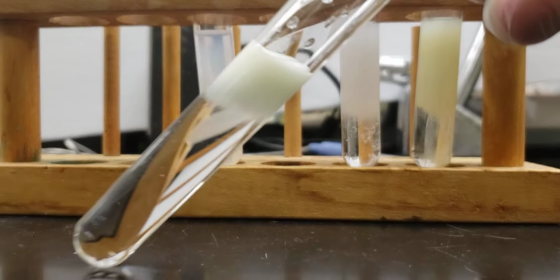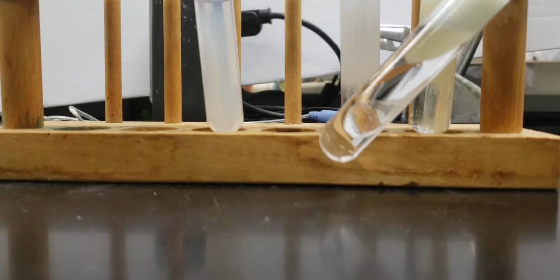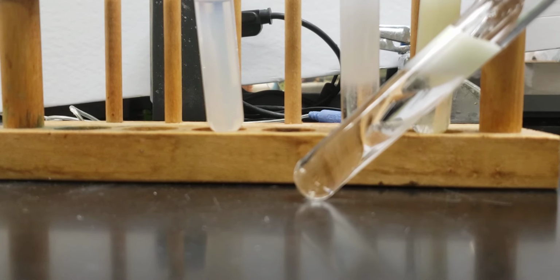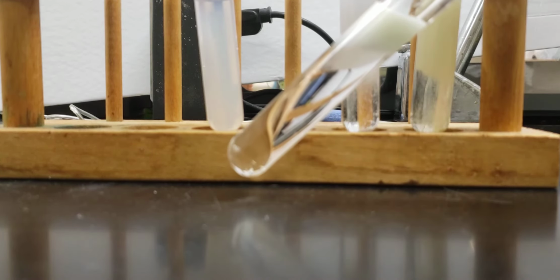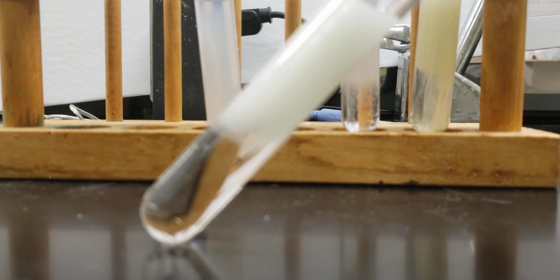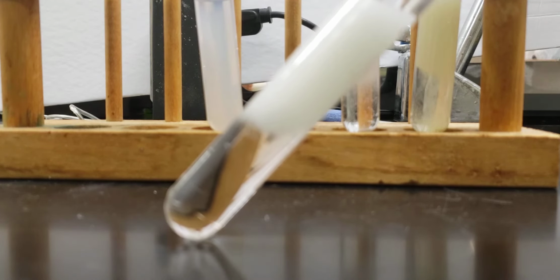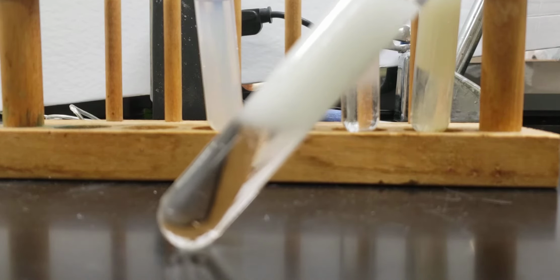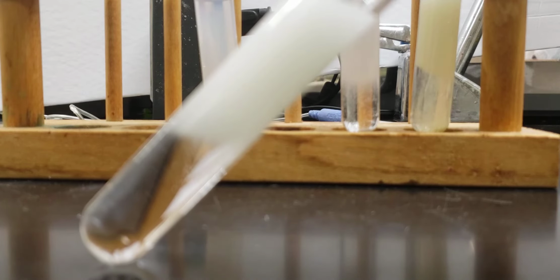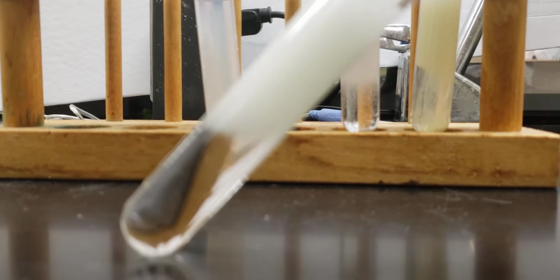Our final one is this one here. As you can see, right next to the other one, it looks like it's a little bit more white and a little bit more yellow, and it's the one that's right in the middle. We give this a shake, and you'll notice that this one also has those solid particles that are starting to flow down, provided that it refocuses on the thing that we want it to.